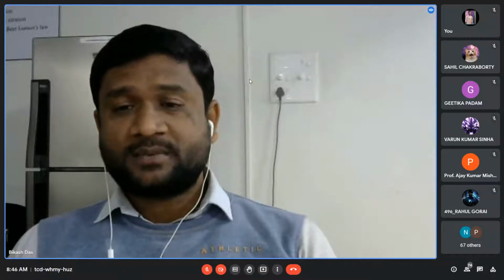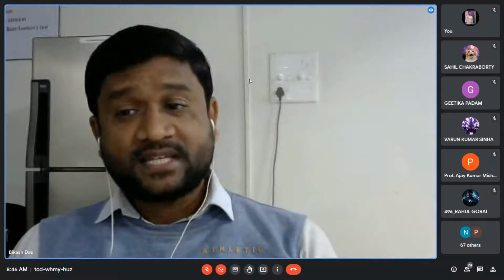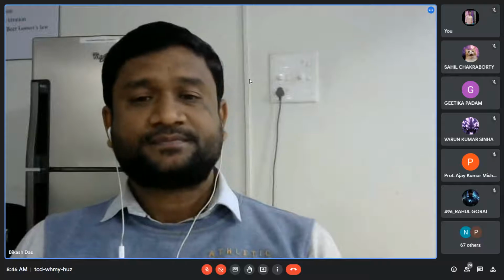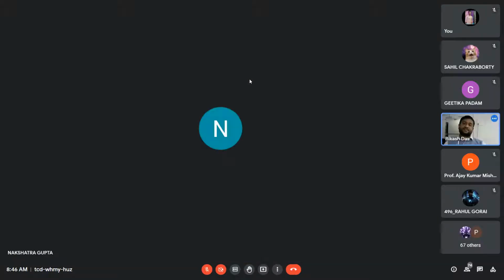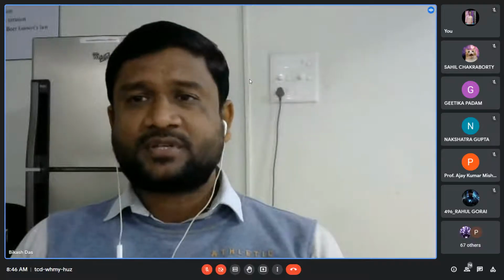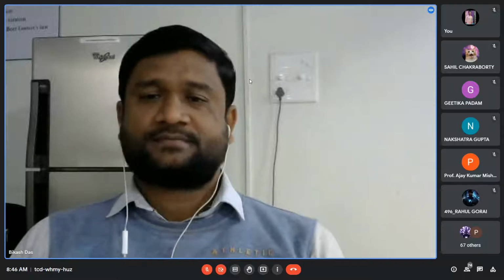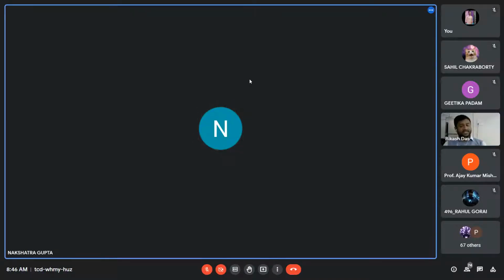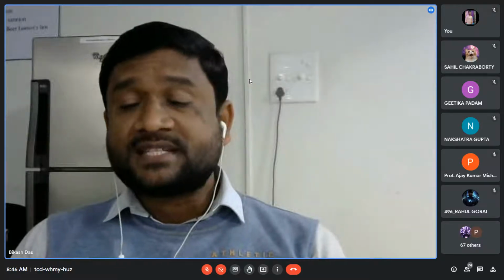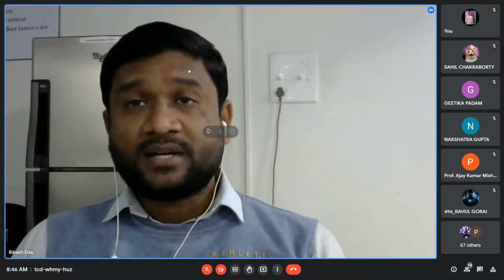Because someone has given the answer that this experiment belongs to acid-base titration. All of you agree with me? Yes, sir. Nice. Acid-base titration. But Nakshatra, I have a little confusion that acid-base titration also has two types. Sir, acidimetric titration. Yes, exactly. I'm very happy.